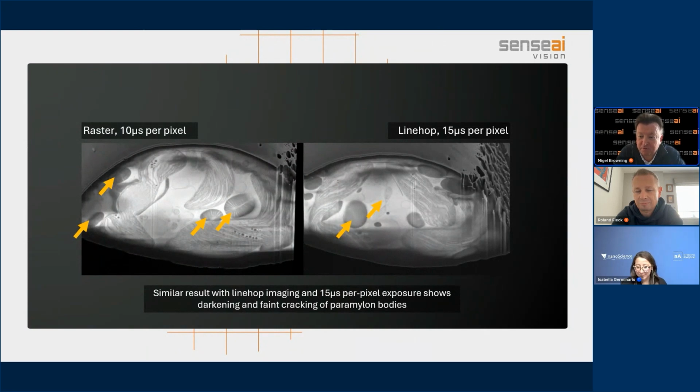Now, the way that we have verified it in the past is that we have the ground truth 100% acquired data for areas where we don't have beam damage going into the system, and then we subsample that data and we do a reconstruction and compare the original 100% image to the 10% sampled image, and that will tell you how accurately you've done the reconstruction. So when you have conditions that you can do that with, which are the cases where you don't have charging, you don't have beam damage, you don't have any issues with the acquisition, then we have found that essentially anything above 10% gives you a very good reconstruction. Anything around 20%, you're absolutely guaranteed to get a lossless reconstruction that comes out of that.